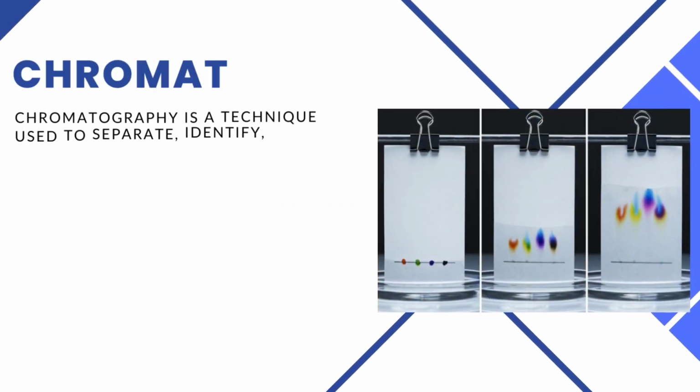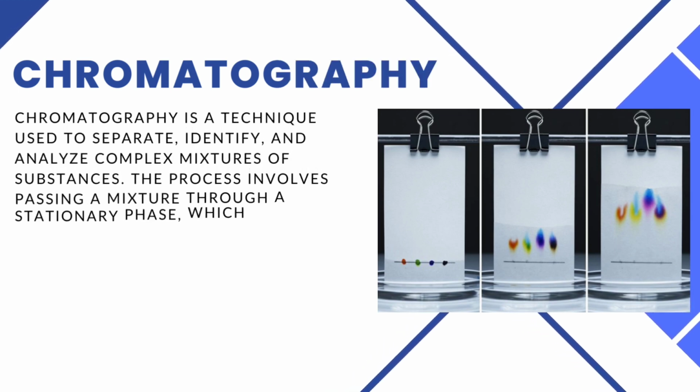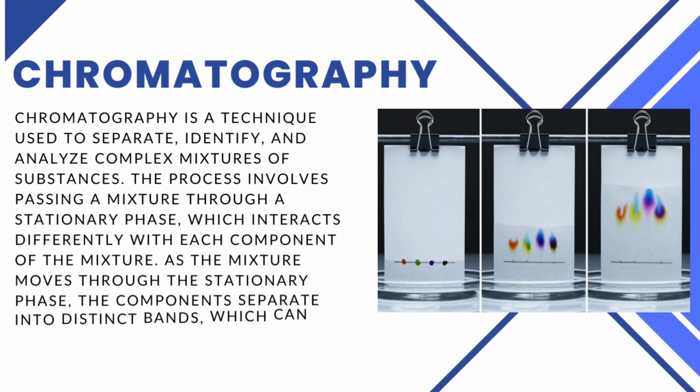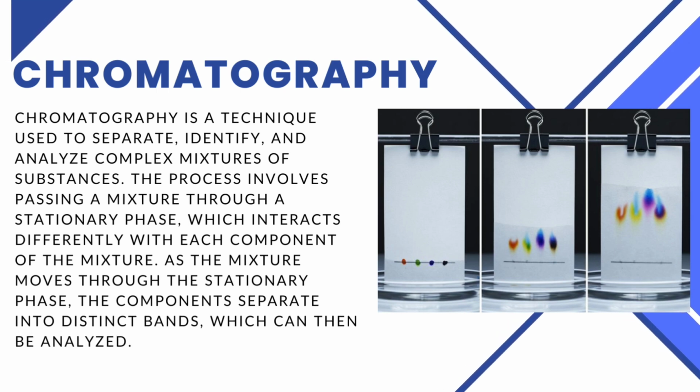Hello everyone. Today we will learn about the practical separation of mixtures of amino acids by thin layer chromatography technique. For that, let us first learn what we mean by chromatography. It is a technique which is used to separate, identify as well as analyze the complex mixtures of substances.